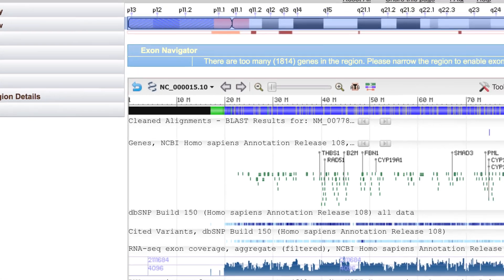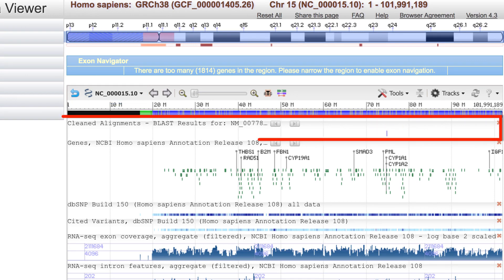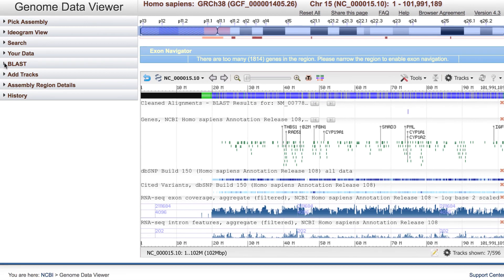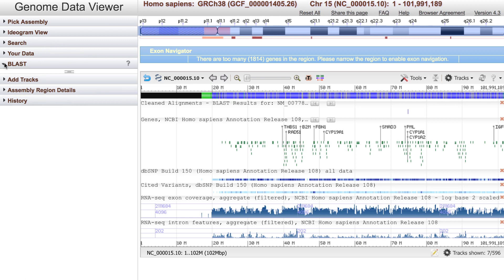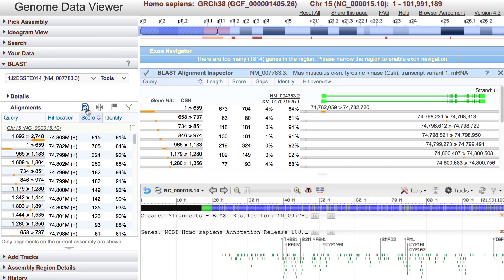That sequence is presented in the Sequence Viewer portion of the GDV. This is where your BLAST alignments show up in BLAST tracks. The best part is, you now have the full functionality of the Genome Data Viewer, including the ability to add your own track data. And a new feature, the BLAST Alignment Inspector, which can be launched from within the BLAST widget.